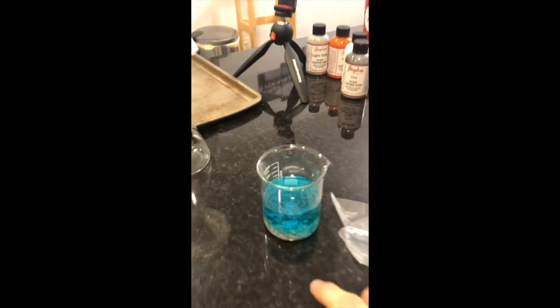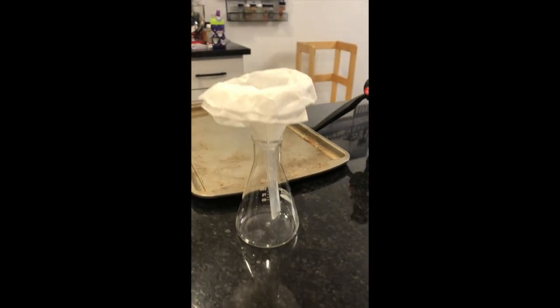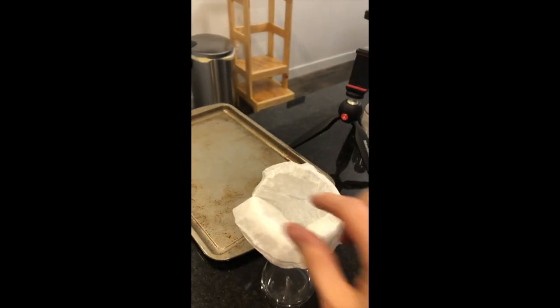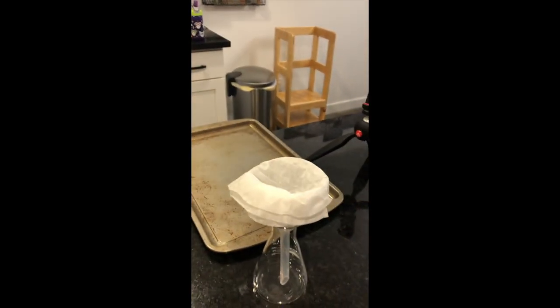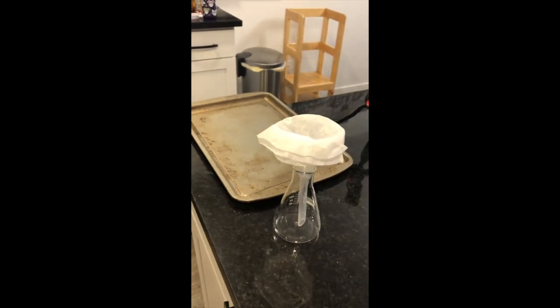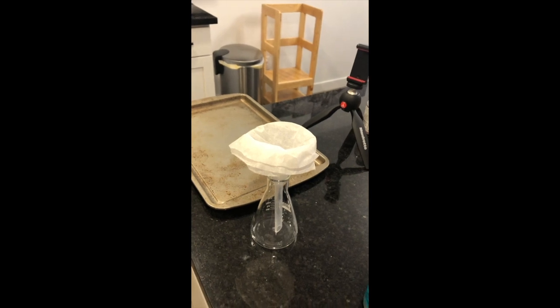So, okay, here's our reaction so far. Let me flip. Okay, so we got a good amount of silver there in the bottom. And now we're going to put it through this filtration system. So I have a piece of filter paper in a funnel, so that can catch our silver, and then the solution will go through. It will also catch our copper, and then I'll pull the copper wire out and get a weight for it.